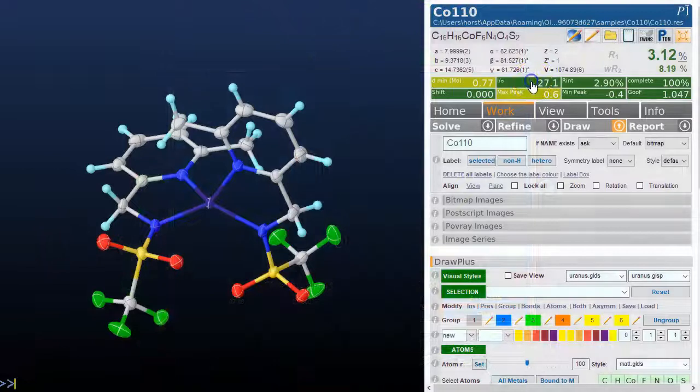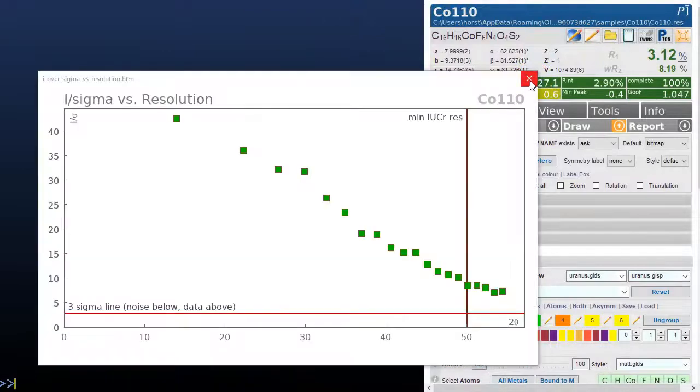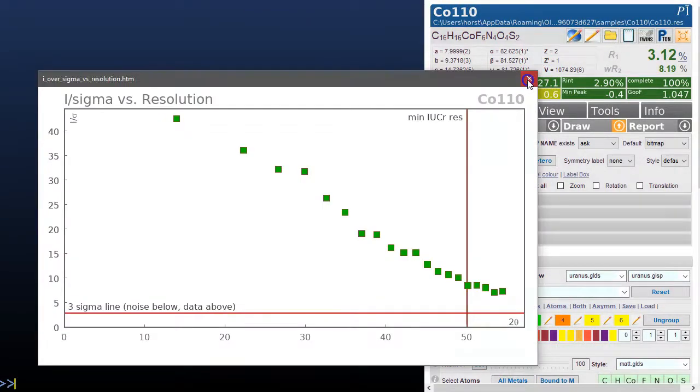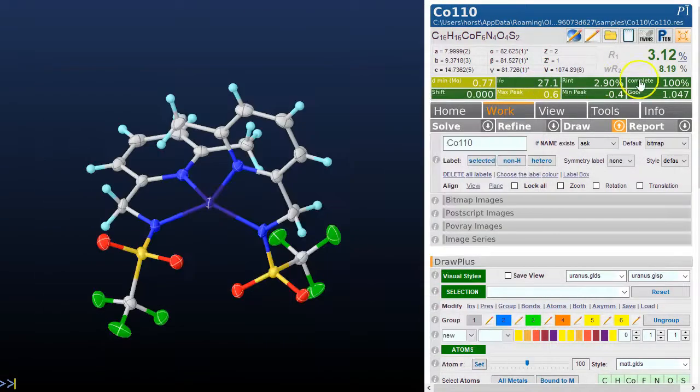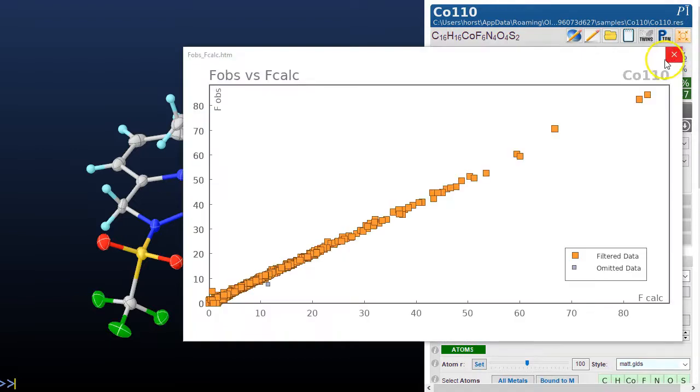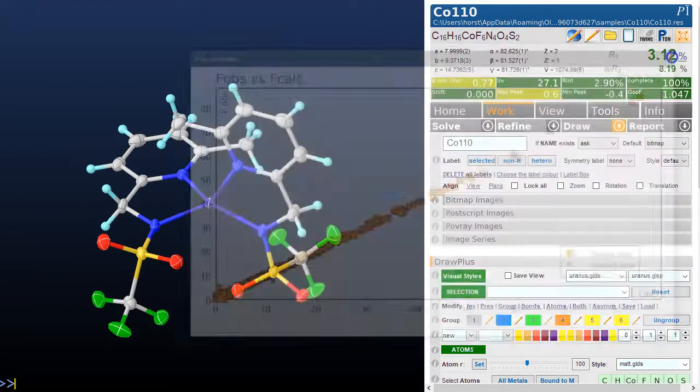Click on these fields to get the graphs. Here is the I over sigma versus resolution graph. Here is the Fobs Fcalc graph.